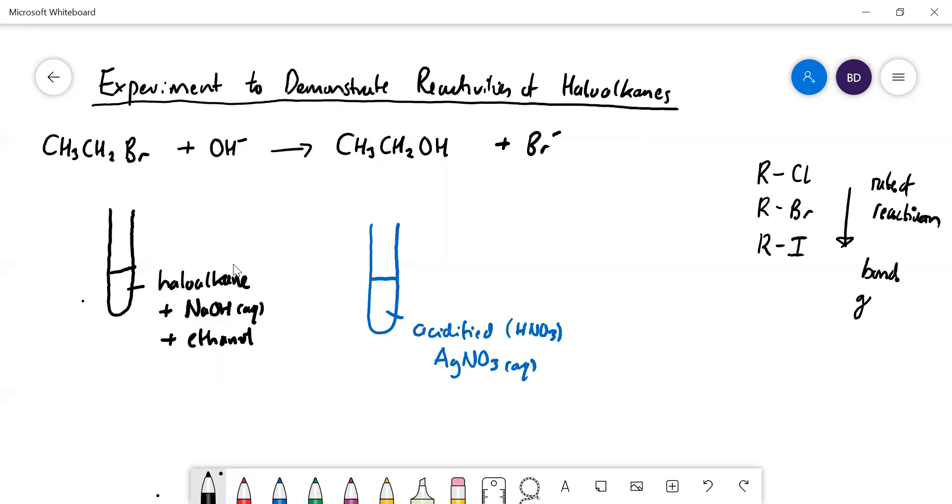Here is a very simple experiment on how we can demonstrate that. Here's our haloalkane - we would use chloroethane, bromoethane, and iodoethane. We're going to react that with aqueous sodium hydroxide.